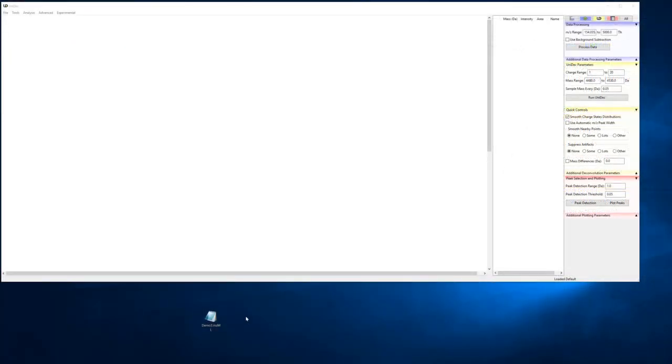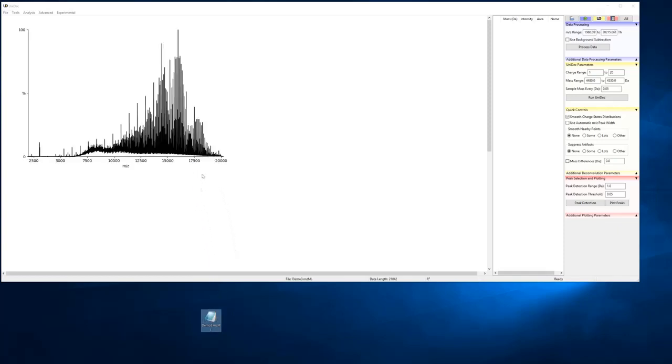The easiest way is to have your data already in the MZML format. Simply drag and drop directly into Unidec. Another way is to first save it as a text file. Depending on the software you are using, this may require an additional step.